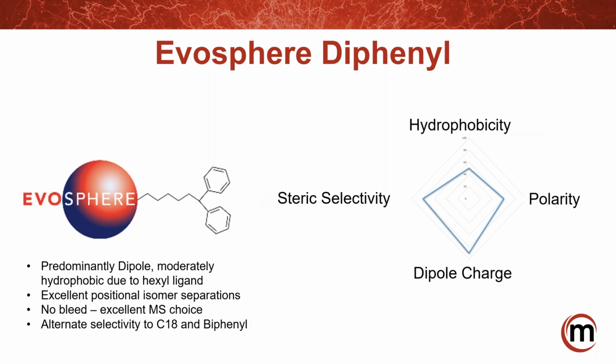for C18 and biphenyl. And the other benefit is it doesn't bleed because of that stabilized phase. So we're in a good spot there.